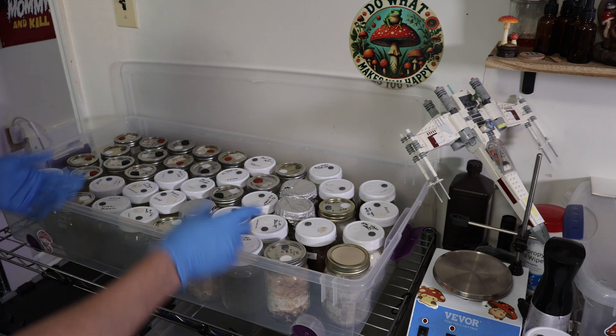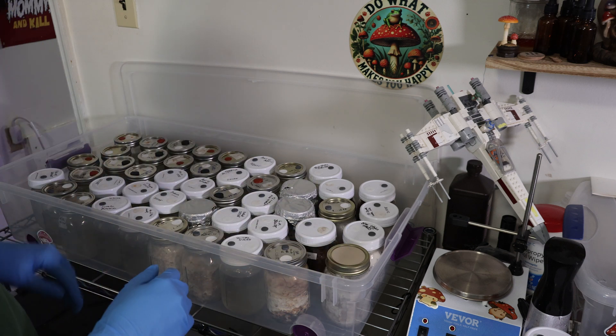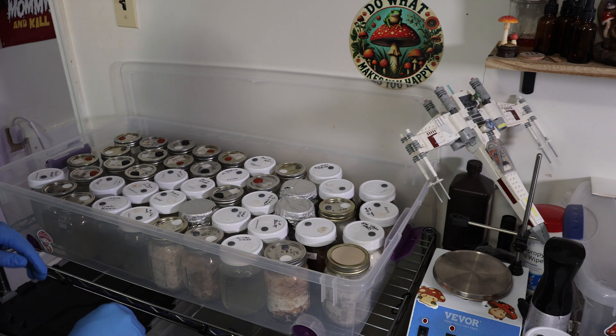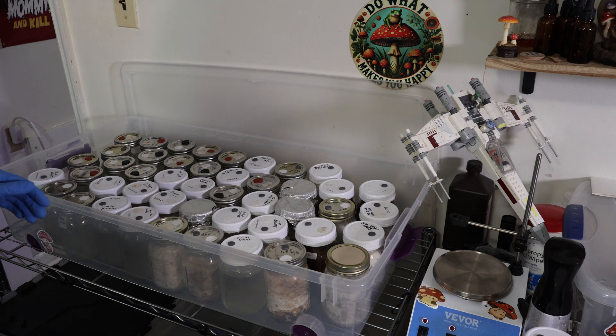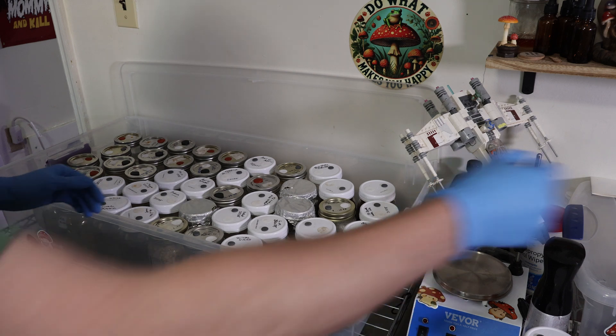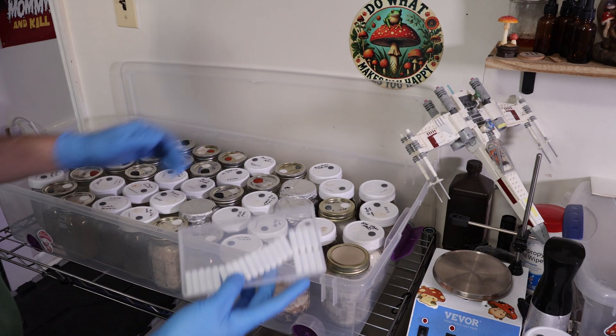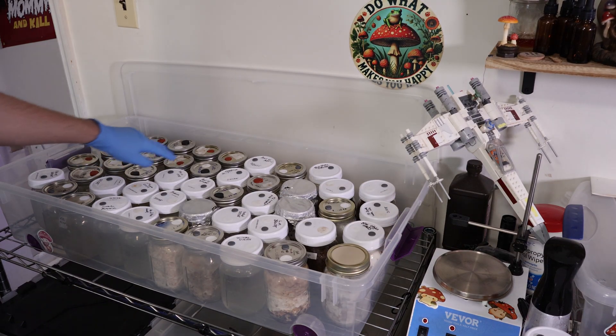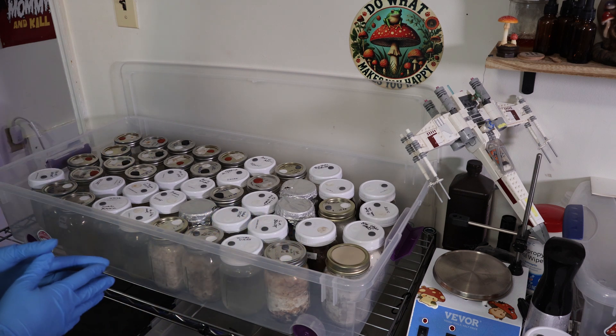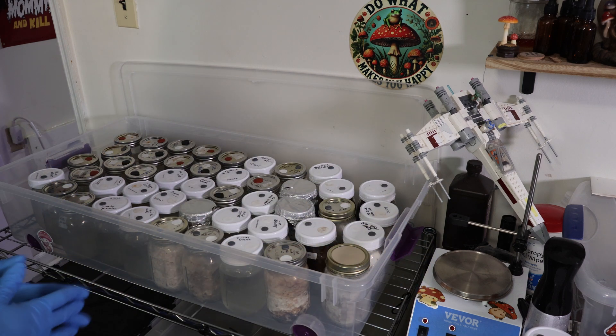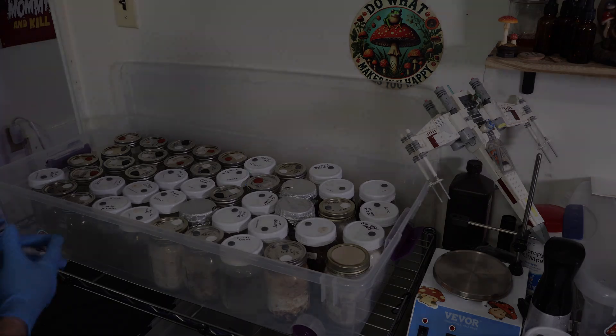Definitely a lot that I have going. I'm expanding cleaning up and a lot of projects that I'm working on on the side as well. But this is the condition of everything. We have this nice little cheap I spent like thirty bucks on this little spinner and we have an assortment of stir bars that I like to use in the liquid cultures and I'm transitioning from these old aluminum lids to all these plastic lids. But we're about to have a whole new grow area so I'm going to be expanding kind of my whole lab set up as I move.